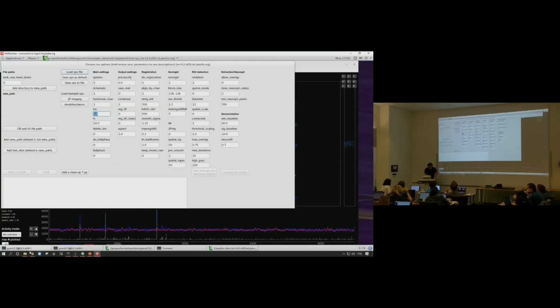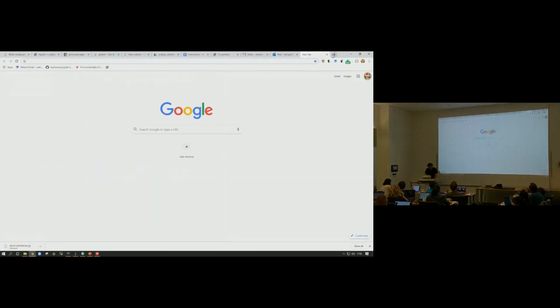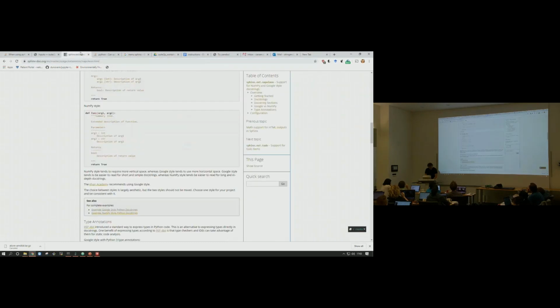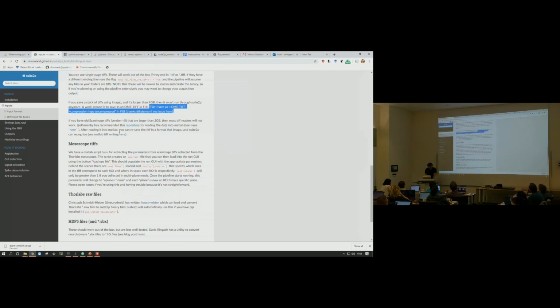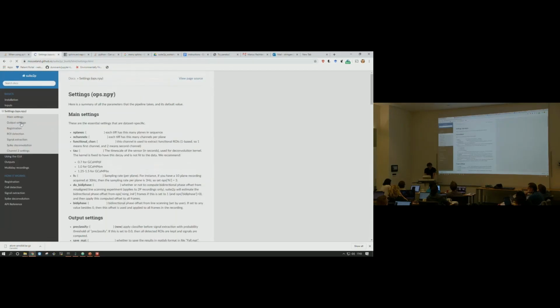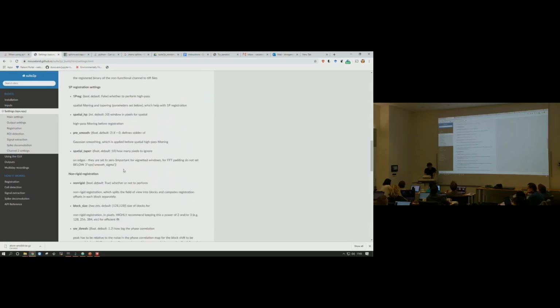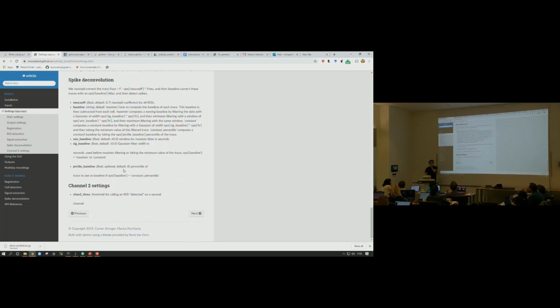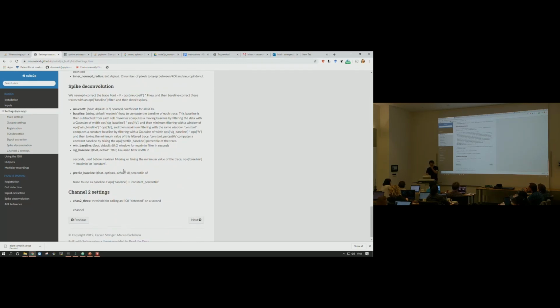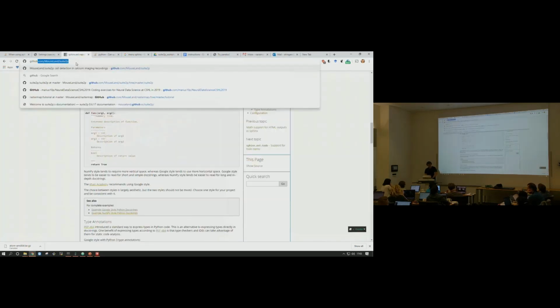These descriptions of the parameters are also going to be on the Suite2P website. So if you go in, it was right there? Yeah, I ported it. Go back. No, 1, 2 back. Click on the settings on the left. I put it in there, but it might not be. Okay, so they're mostly described here. But also, you moved them completely here? They're only here now? Yeah. Okay. They're also on the website, but they're the exact same. I copied and pasted. Okay, so they're also on the GitHub.